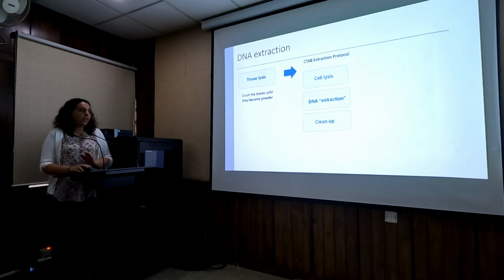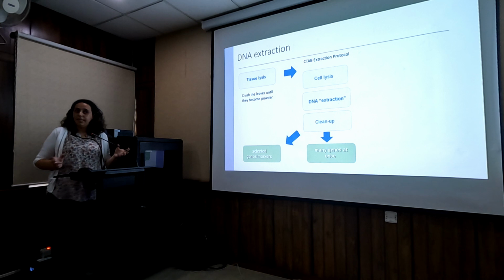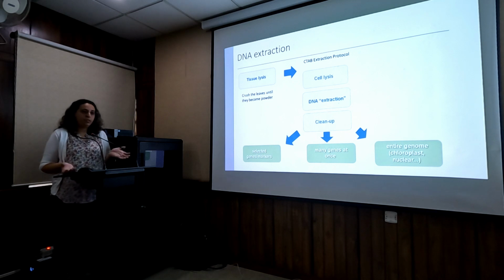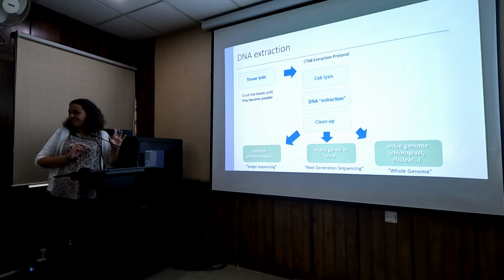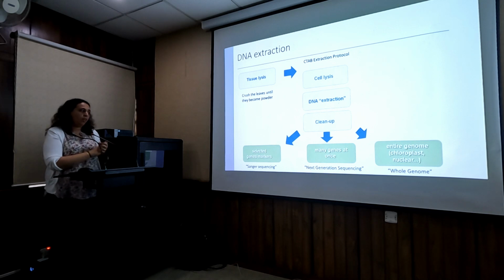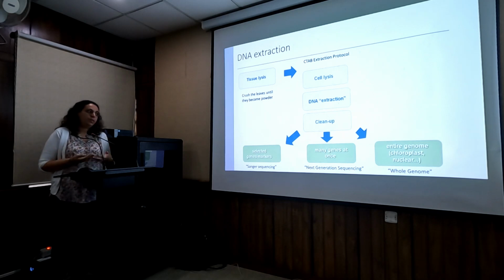So the first step, extract DNA, is one thing, and then what do you get out of it, which regions, is the second part. So you can either get selected genes or selected markers, or you can get many genes at one sort of genomic scale amplification, or you can have the entire genome as it's being done these days. So this is a very simplistic way of putting it. This is again where my non-molecular biologist background comes in, but I hope this helps to organize in your heads. That if you're looking at a couple of markers for your study, you'll probably be doing Sanger sequencing. If you're generating hundreds of genes all at once, you'll be dealing with next generation sequencing, and then you can also think about whole genome.